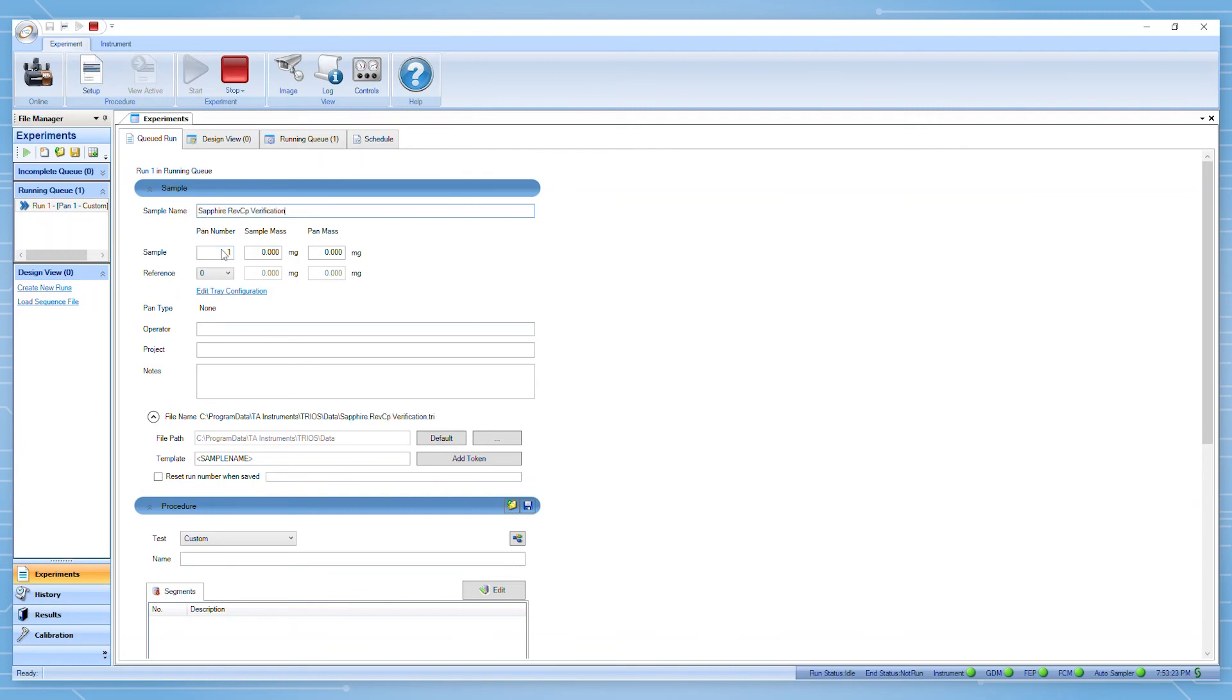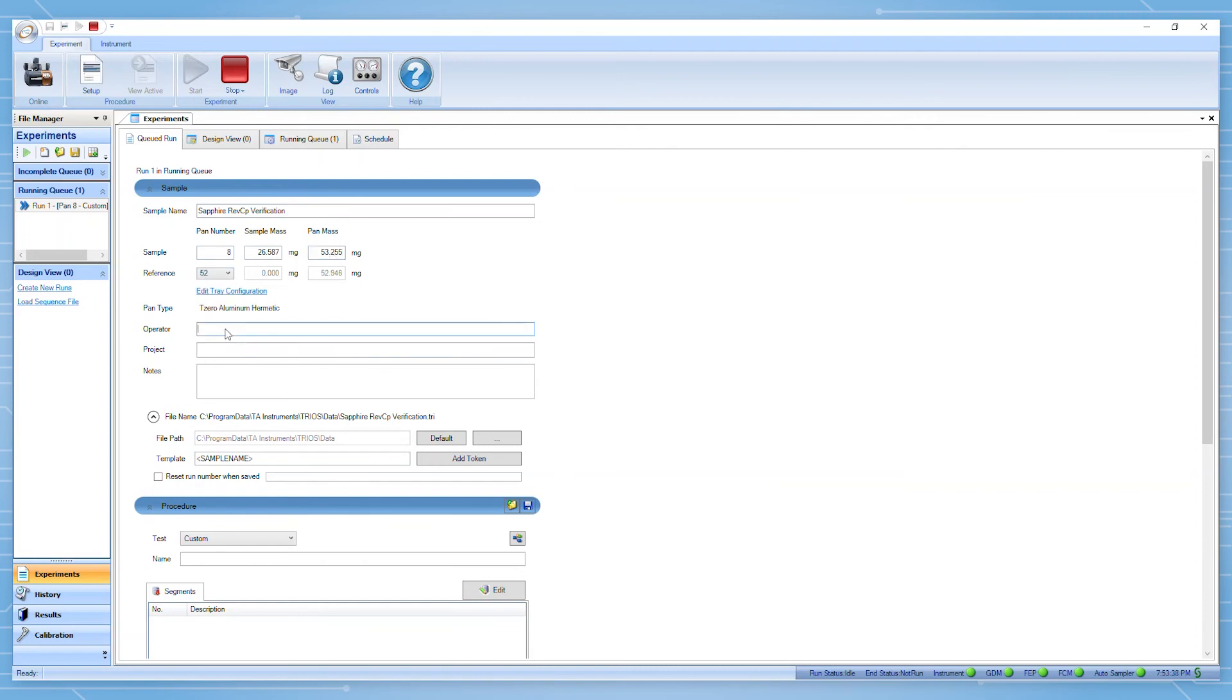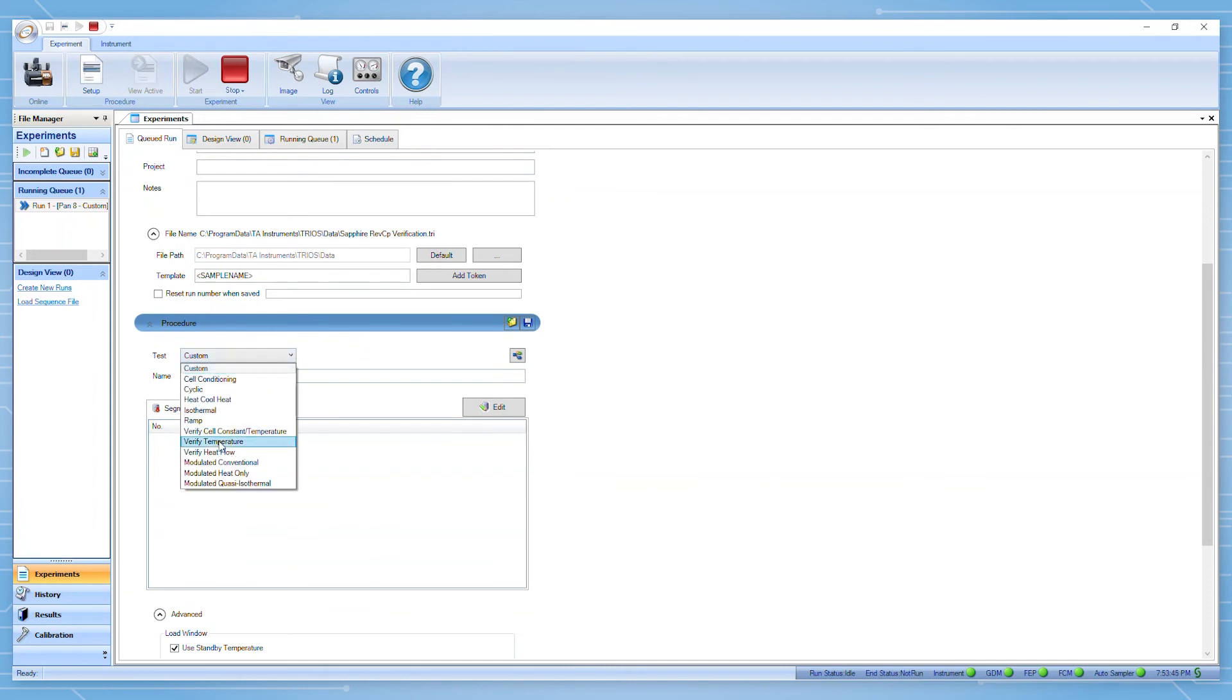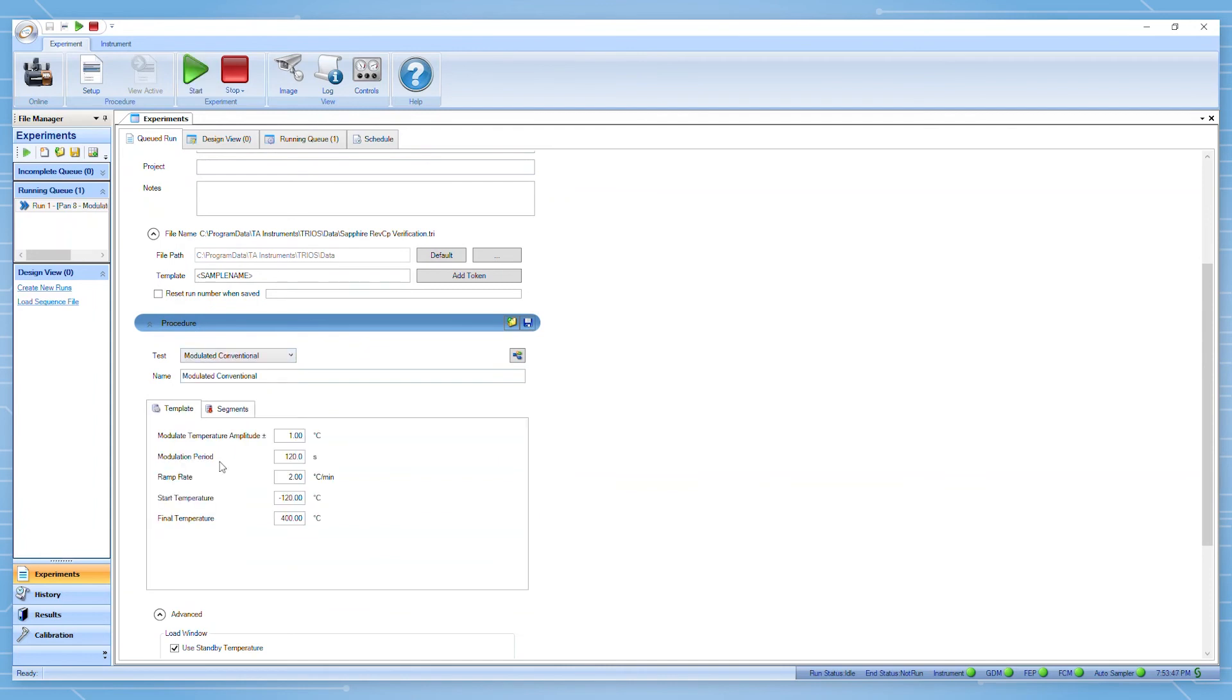Here we are starting a new experiment and inputting the appropriate sample information. We can then go to procedure and select the modulated conventional template and input the same parameters which we used during the calibration.